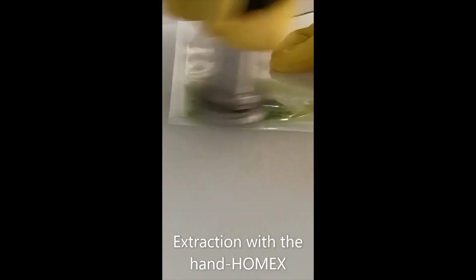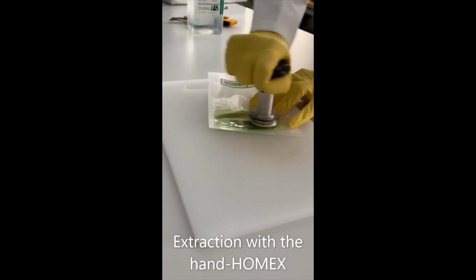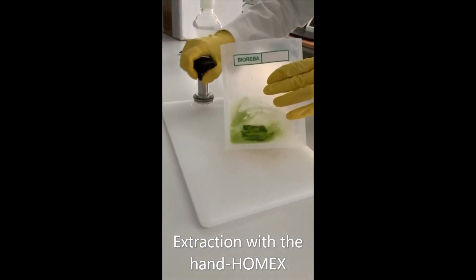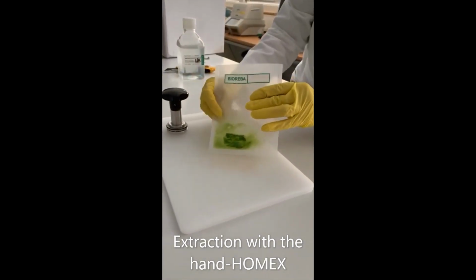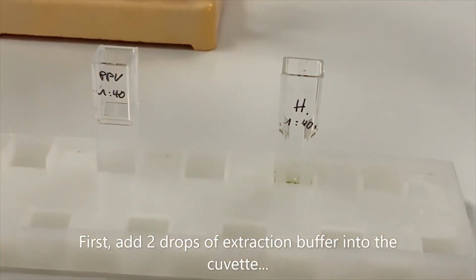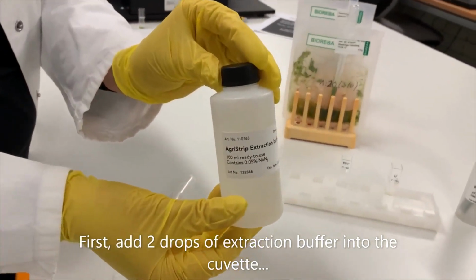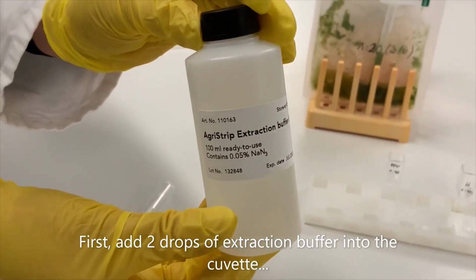This does not have to be 100%, but you have to crush or squeeze most of the sample. You can also use the back of a pen or something, and this is how the 1:20 dilution looks like.